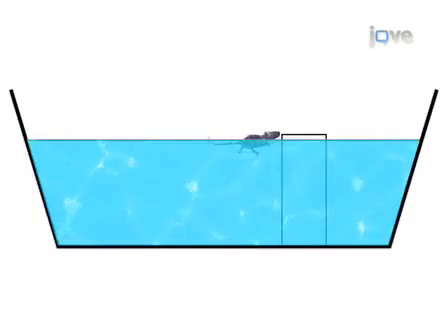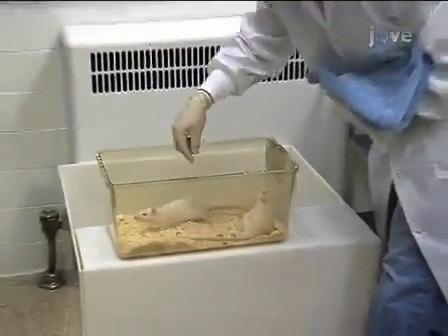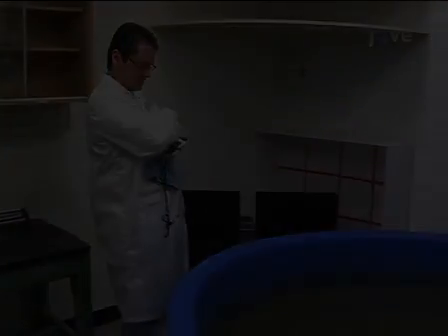Now we are ready to begin the training of the animals in the water maze. The water maze has four starting positions: north, south, east, or west. Take the animal to one of these positions.